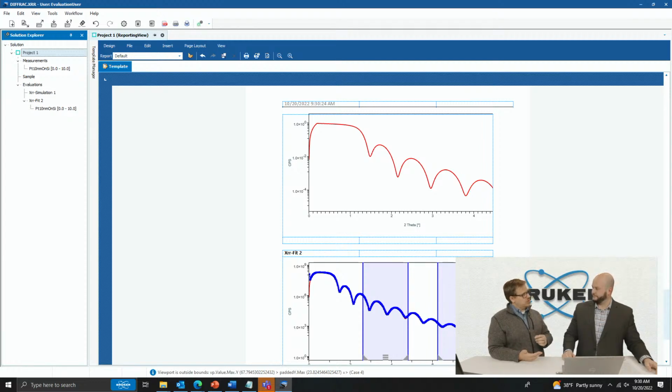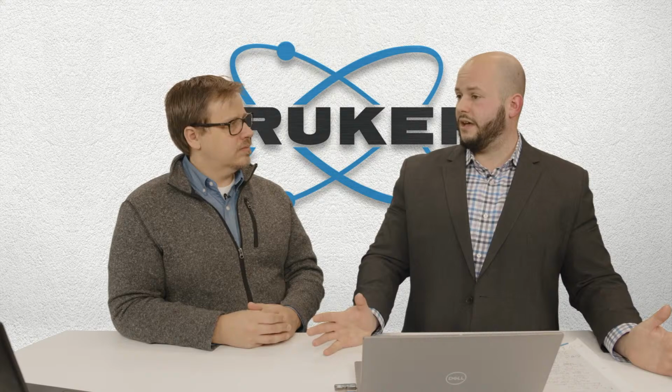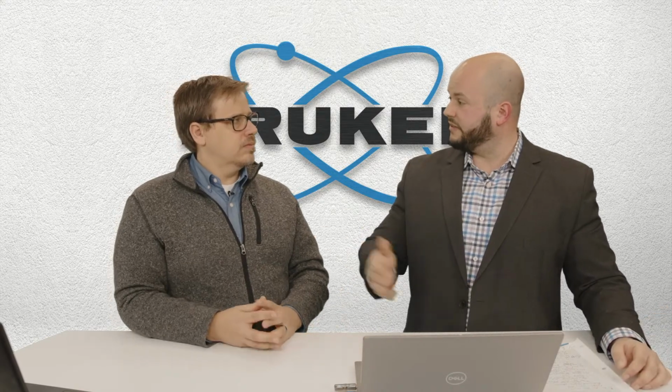And you can also do some other things to help you, right? Like samples and stuff like that. That's right. So in the next few examples, we'll actually import samples that were already predefined that you can save in the software. Another thing we have the ability to do is create workflows and things like that too.